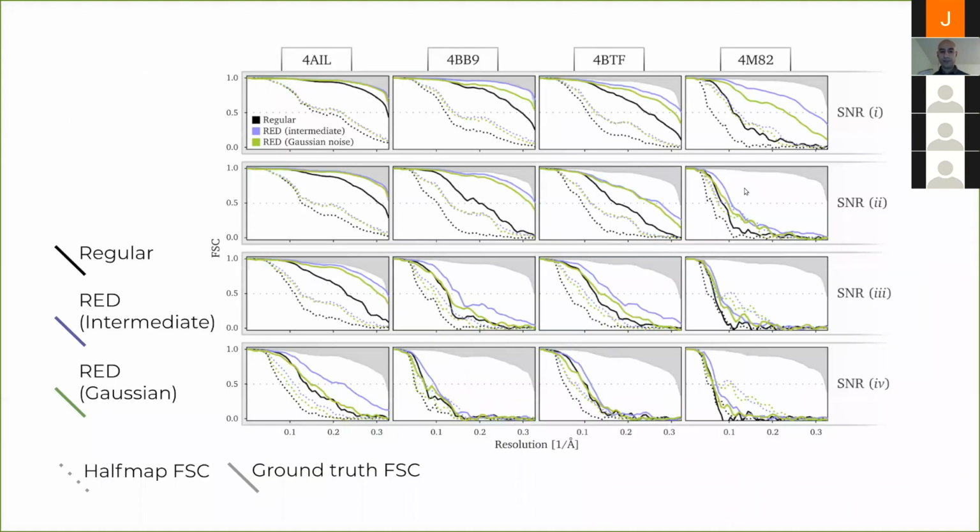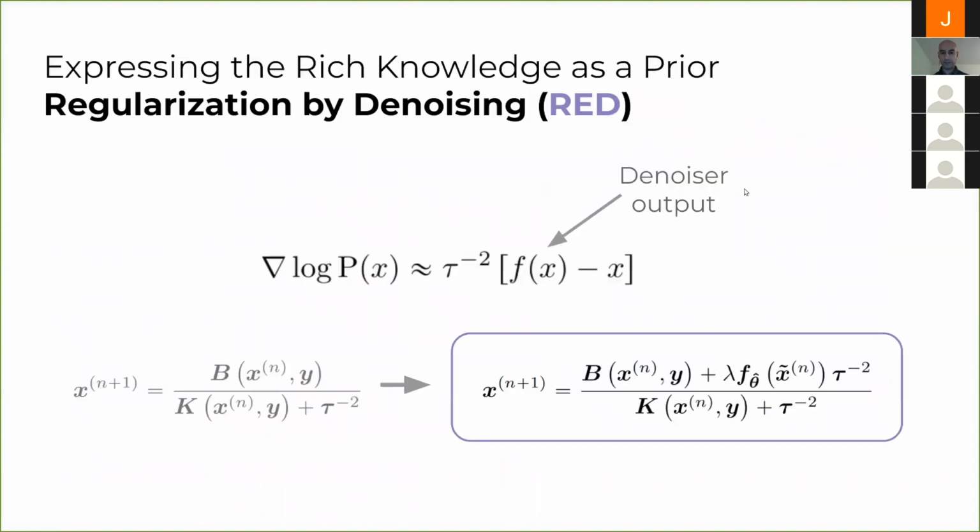And what we did was basically taking PDB structures and using a very simple method. We used Eman2 for turning those into a volume. And then we took those volumes and we generated a bunch of noisy 2D images that look like cryo-EM images. And then we used Relion to reconstruct those 2D images into 3D volumes. And Relion did the usual thing, generating all these intermediate reconstructions. And all of those intermediate reconstructions, those are these X's.